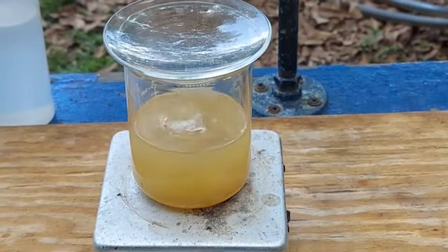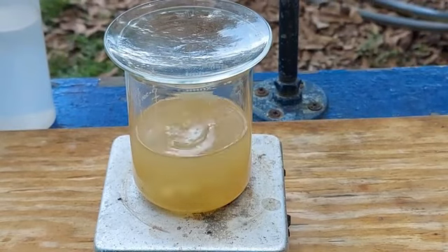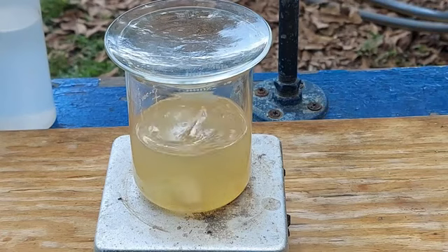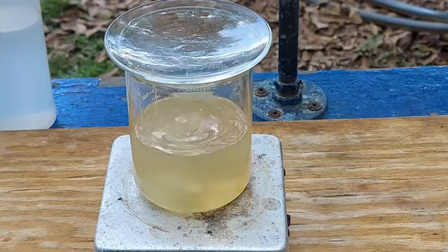Alright, so I completed the extremely messy business of getting that coffee filter out of there and rinsing almost all of the mercuric oxide off of it. There was a little bit I wasn't able to get off, which I finally decided had to go in the trash. It'll go into the landfill where it will be prevented from being released into the environment. So don't panic, we're not contaminating the world here.